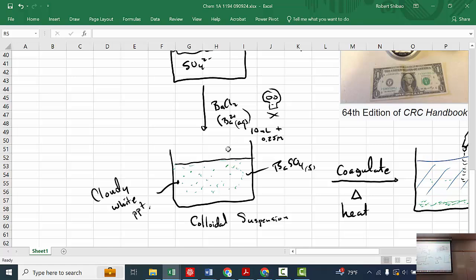Okay, what a lot of people do when they're in the weighing room, I see this all the time, is they just leave the lid off. Do you want to leave the lid off for a long time in the weighing room? No. You always replace it. The other thing is you could bring the desiccator in, but you're probably okay just replacing the lid after you weigh it, because these salts don't pick up that much water. But just make sure between weighings. Now, each of you will weigh your own sample. So once one person's done, pass it to the next person in your group.